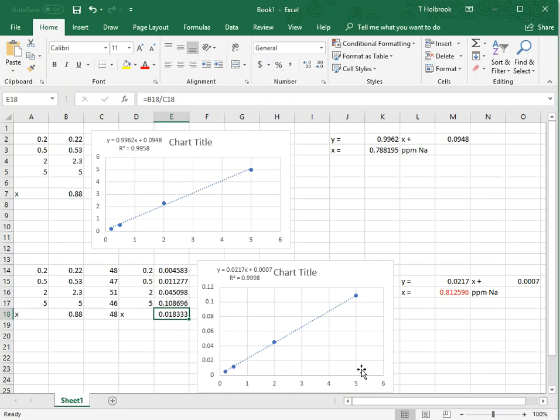Once you plot your Cal curve, once you get your linear regression line, once all of that goes onto the graph, you solve it just like you've always solved calibration curves. There's no difference, except for the fact that you are putting your ratio in for Y instead of the hardcore signal that you're getting for the Y. That is the only difference in the calculation part.